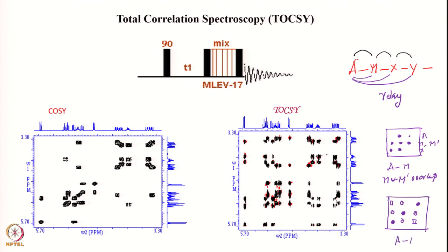This will be AMX and not AM plus M prime X. So, this is not true, okay. Therefore, this I can eliminate. I can eliminate this in the TOCSY spectrum. This is a TOCSY.